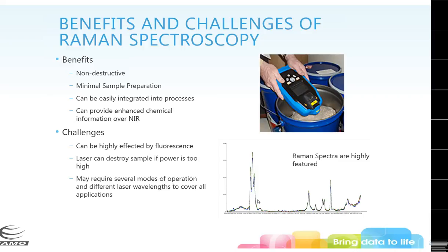The challenges are that Raman can be highly affected by fluorescence. If any part of your sample fluoresces or you don't use the proper wavelength, you'll see a very strange baseline — your features are still there but underneath or on top of a difficult-to-identify baseline. The laser itself can destroy the sample if its power is too high, so you have to be careful about focus and laser strength. Because of these two things, you may require several modes of operation or different wavelengths, and a lot of Raman spectrometers have a tunable laser to get around the fluorescence issue.